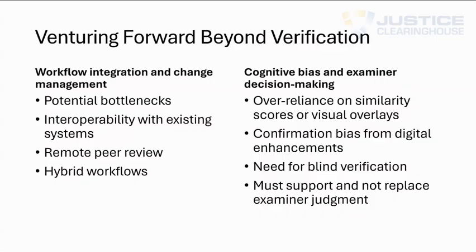And I do believe that it is as important for the trained firearm examiner to calibrate that criteria for identification by looking at known different source data as well as known same source data and seeing what that looks like on a virtual comparison microscope. It is really important to calibrate our identification criteria. We're looking at far more data than we've ever seen before. And it's important to acknowledge that, respect that, and understand that proper training can help deal with that.